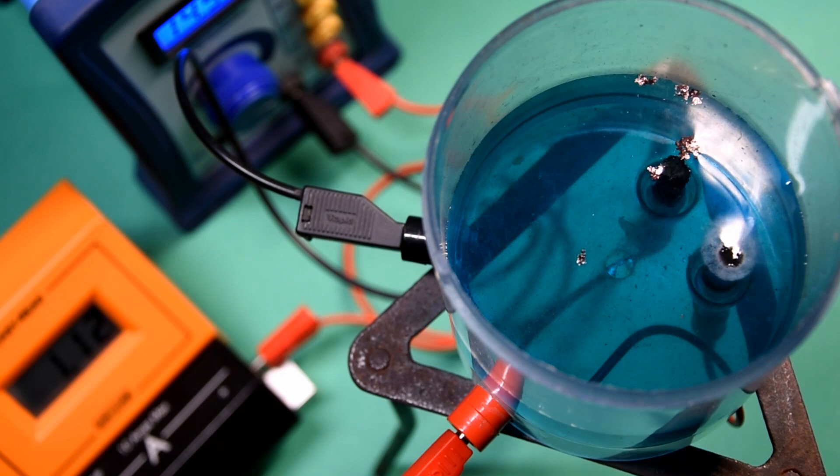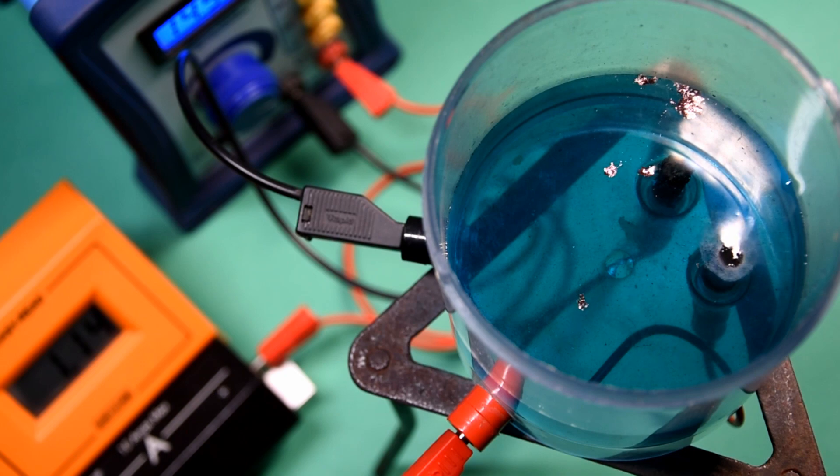The copper tends to float on the surface of the copper sulphate rather than adhere to the cathode as you'd like. It might be sensible to collect the gas and test it.